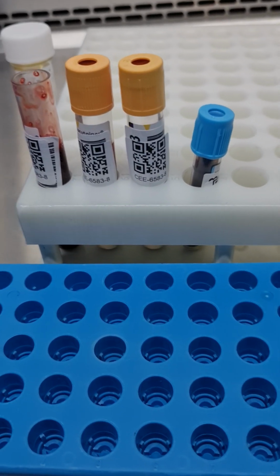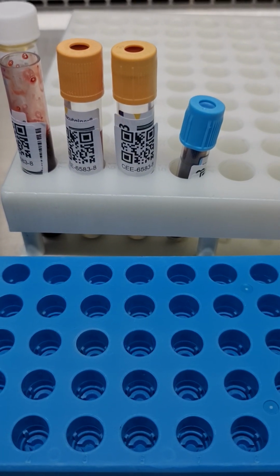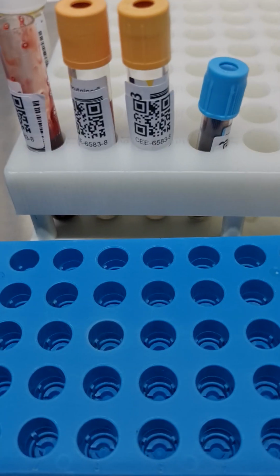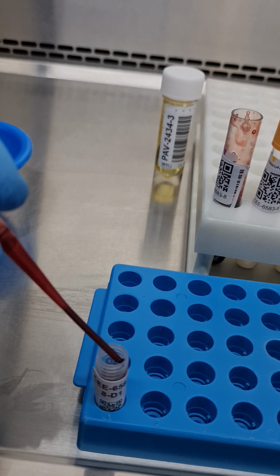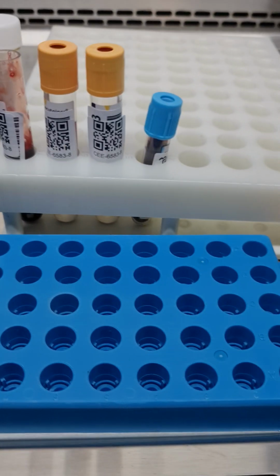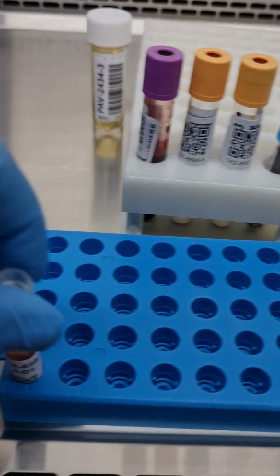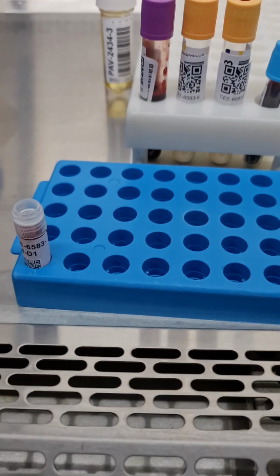Before centrifuging, I will just pipette 2 ml of whole blood in D1. Close the purple tube. So D1 is done.